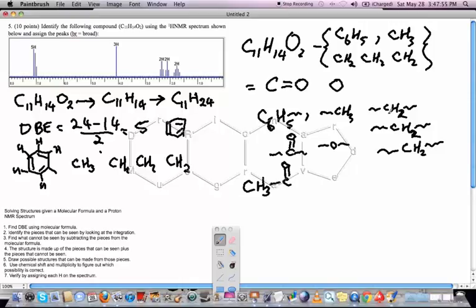Now looking here, we've got three CH2s and an oxygen left over. So I've already accounted for that and I've accounted for that. And I know that this C6H5 group is going to be on the end because it's only got one join point. So now we just need to figure out the order that these are connected in. Now let's take a look at the CH2s. If you look at what we've got here, we've got a CH2 that's got five peaks. Now if a CH2 has five peaks, what that means is there must be four adjacent hydrogens to this CH2. N peaks, N-1 hydrogens on adjacent carbons. So five peaks, four hydrogens on adjacent carbons. That tells me that I've got a CH2 that's got two CH2s next to it. And that matches up with everything because now we've got three CH2s in a row and that's what's been suggested by all of this. So I know that that's all together.